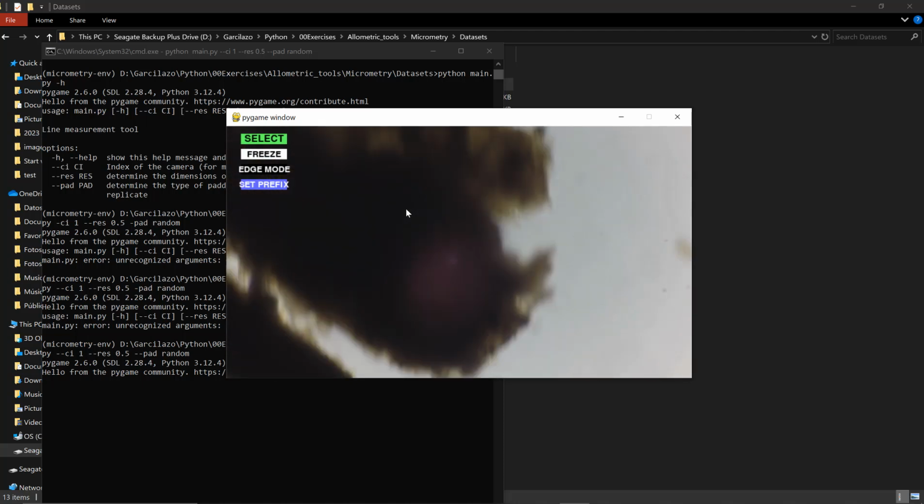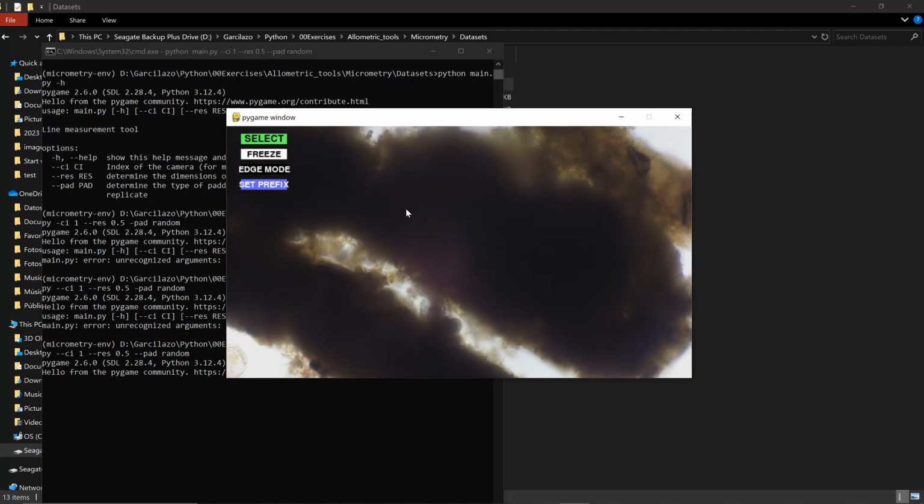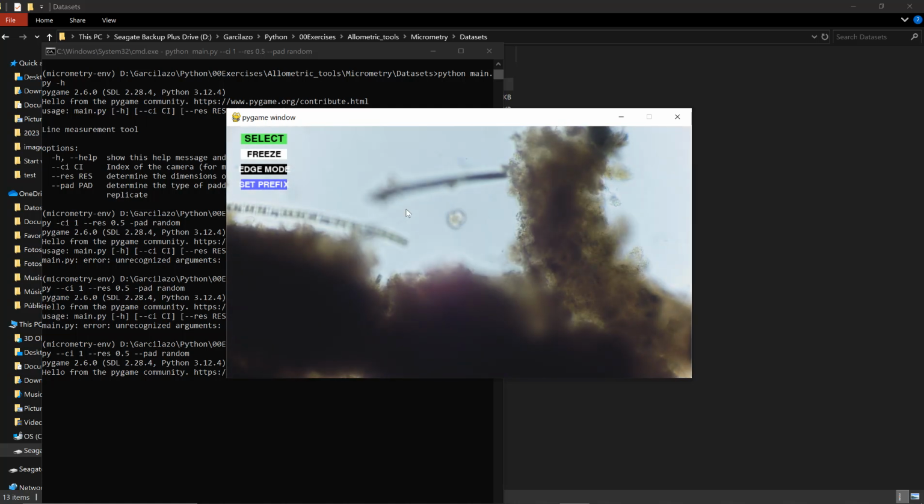Okay, so here we are. And if I remember correctly, I had some rotifers in here. Poor guys are getting squished. Yeah, there they are. But I think I'm going to start a new class. Let's just use that one.